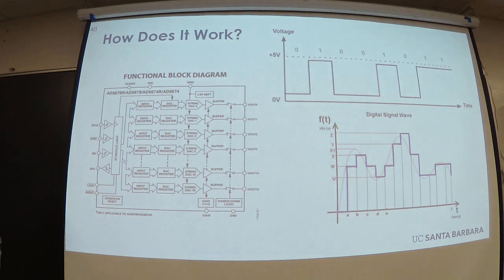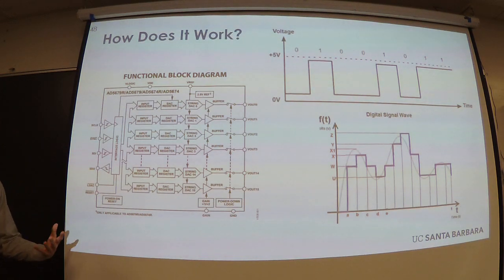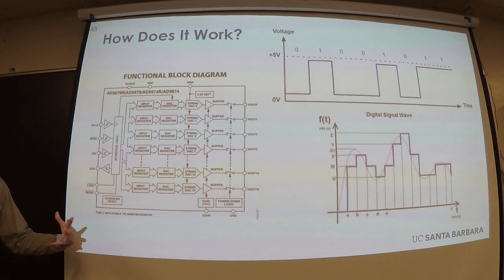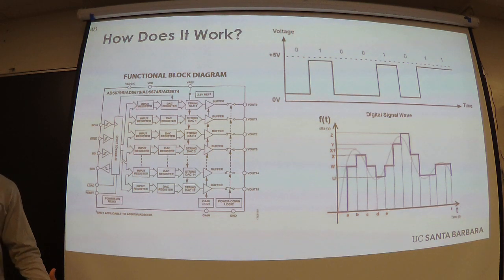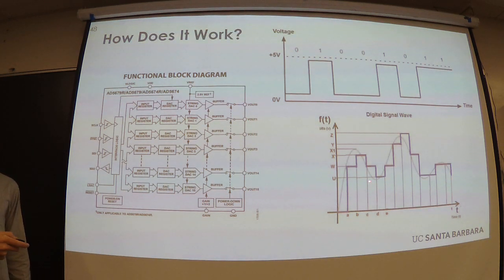Now, I glibly mentioned digital to analog converters and said, oh, you can just make them have the waveform that you want. But I want to explain how that works. And the answer is electrical engineering, but since I'm not an electrical engineer, I'm not going to go into that. You can just think of digital to analog converters as a magic box. And the magic box takes in an input, such as a digital command, so ones and zeros that you send with your microcontroller. And it outputs some voltage.